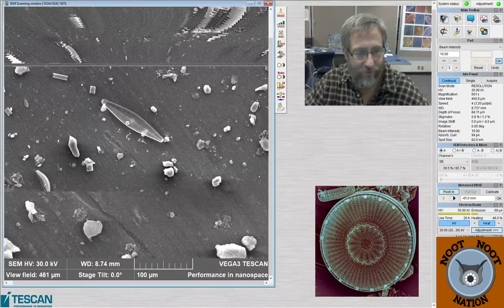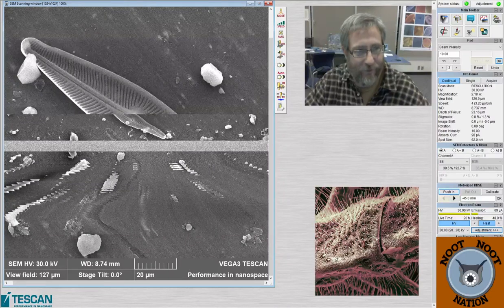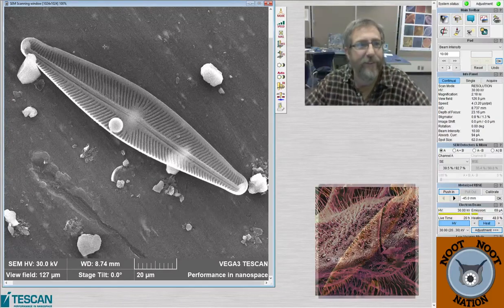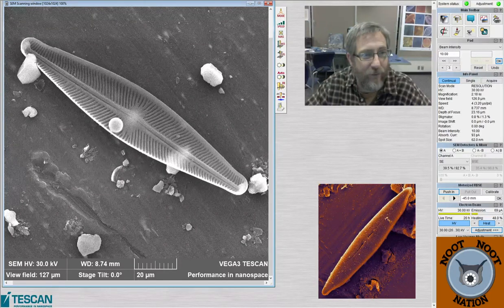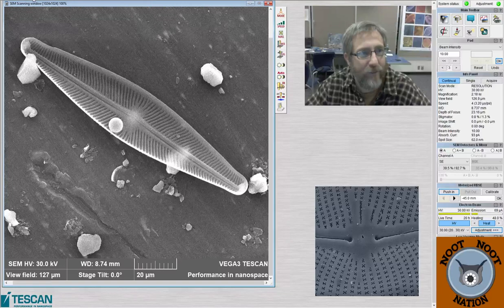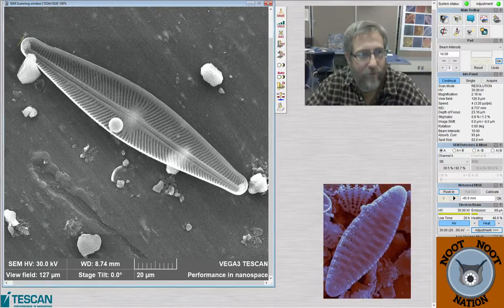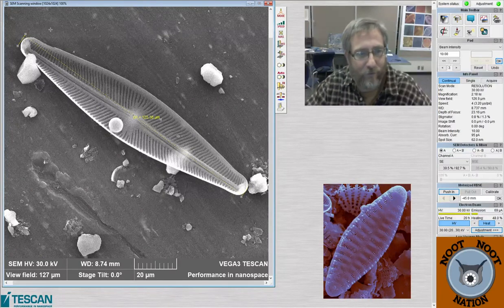Not sure about the name of that diatom. That is a really monster-sized navicula, though. Really big. And it's too bowed out for oblonga, so it's like Aurora or something in that group. Like 125 microns.